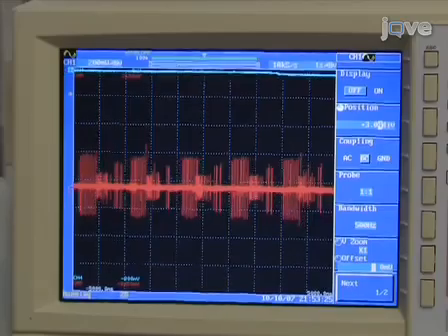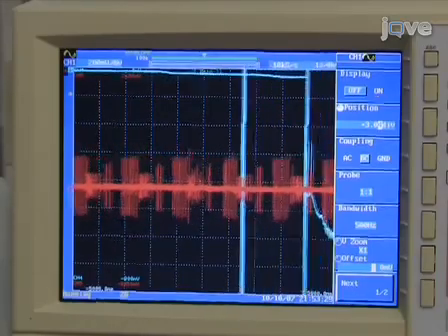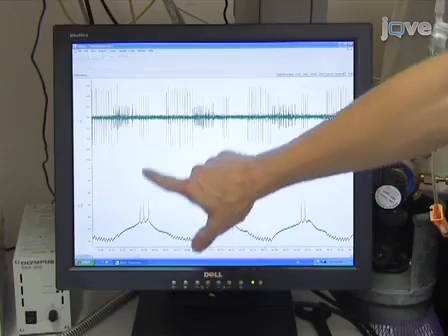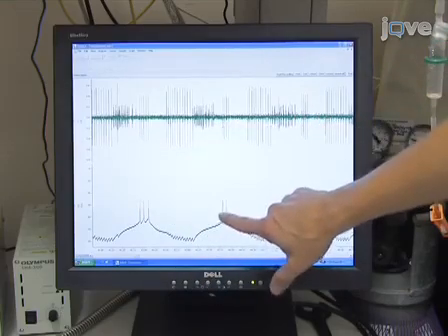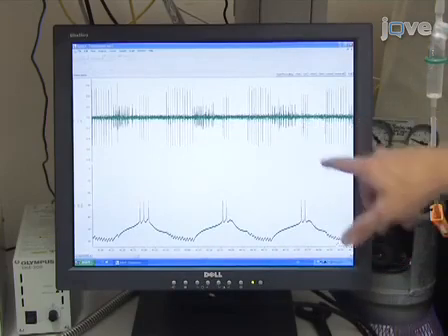Monitoring progress on the oscilloscope, gently pierce the membrane of the selected stomatogastric ganglion neuron. At this point, compare intracellular and extracellular recorded action potentials in order to identify the impaled neuron.